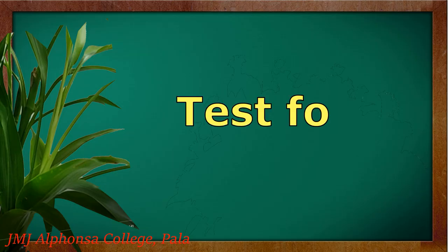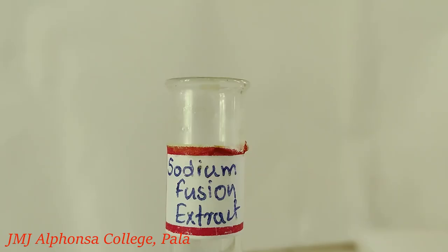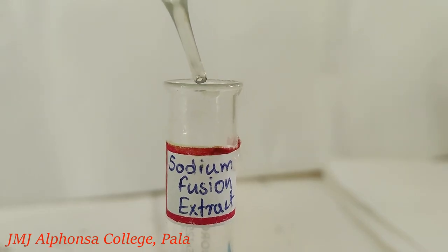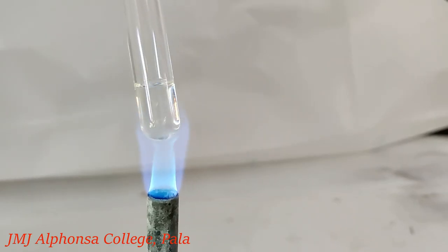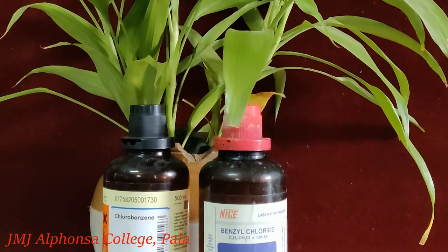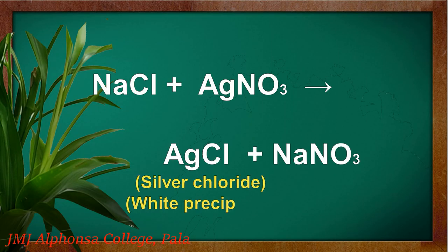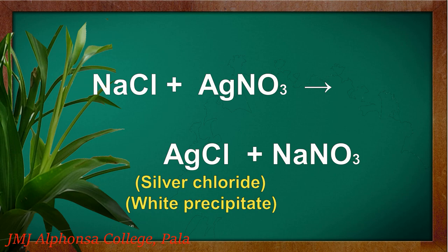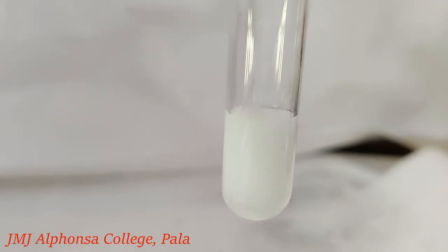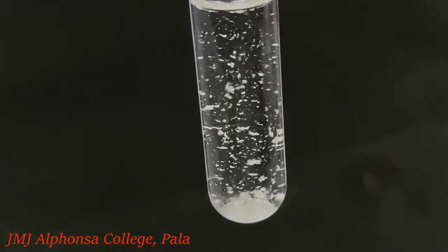Test for halogens. Take a little of the sodium fusion extract. Add a little dilute nitric acid and boil well. Cool it and add silver nitrate solution. If chlorine is present in the organic compound, the sodium chloride formed during the fusion reaction forms a white precipitate of silver chloride on reaction with silver nitrate. Add a little ammonium hydroxide to it; the precipitate disappears.